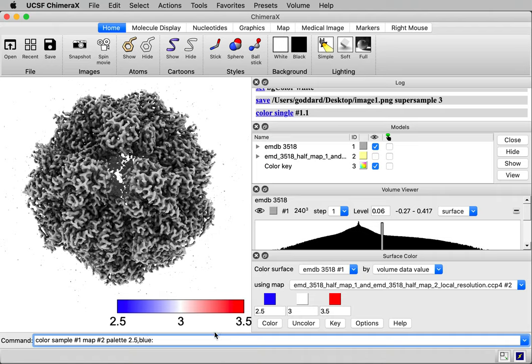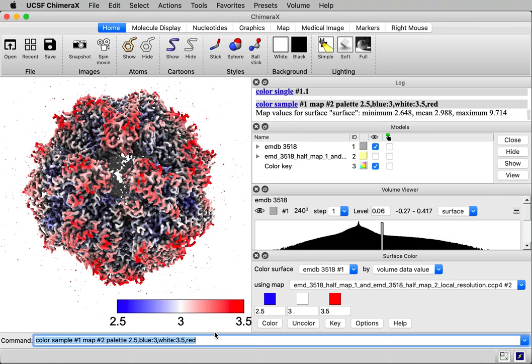And then I specify the color palette. I'll say 2.5 comma is blue, then a colon 3 is white, and 3.5 is red. Okay, so that's the command way to issue the coloring. Thanks for listening.